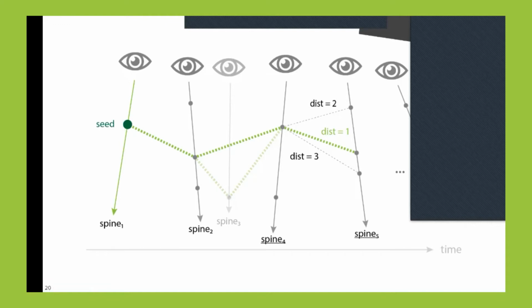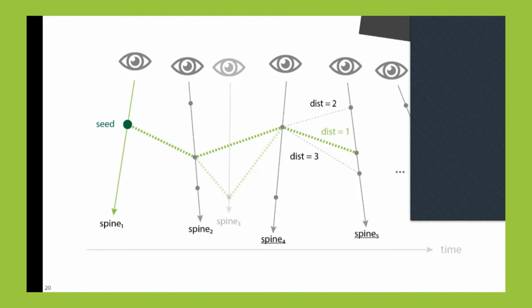And should the algorithm fail at some point with doing that, again, as said, this is an algorithm that is very simple. It's not made for being ultimately robust, but it's meant to be good enough. And if the result turns out not to be as good, you just push a button, you track the cell again, done.